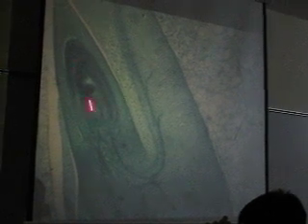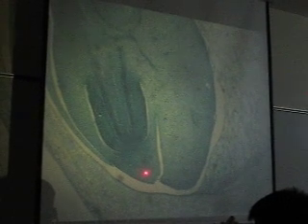Now under the microscope, that would be endosperm, scutellum, mesocotyl, coleoptile, growing leaves and stem tip. How about the base? Endosperm, scutellum, coleorhiza. It even looks like a root, doesn't it? Radicle, see the procambium, vascular strands there?